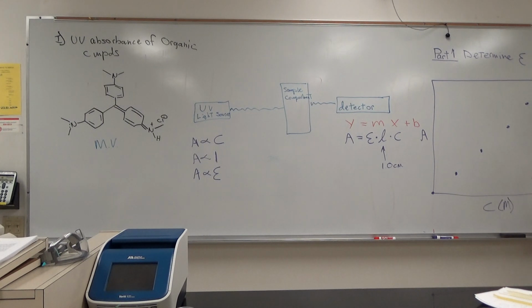It also says in the directions that the x-axis should be the concentration and the y should be the absorbance. I was actually trying to think of what the line would look like if you did it the other way. Anyway, for the time being, just do it this way.